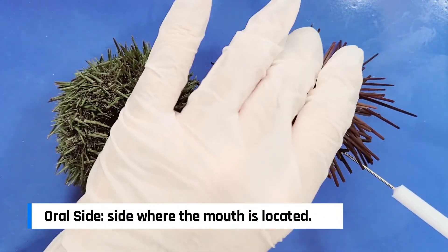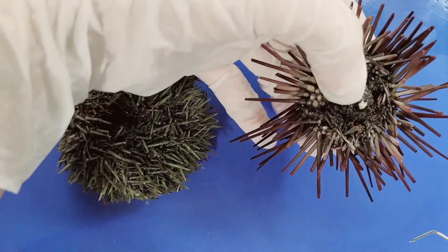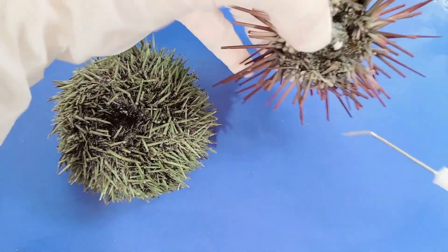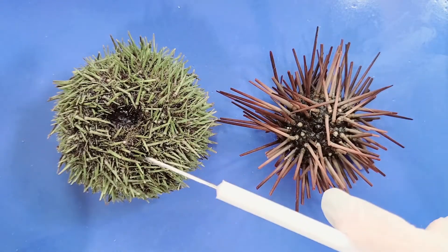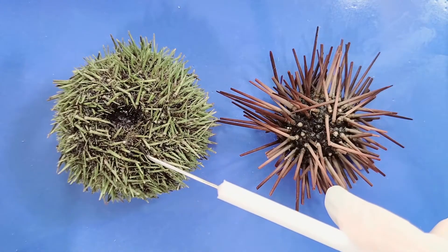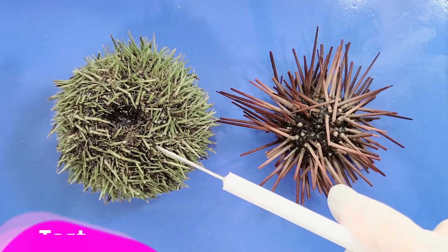You can also see this in the purple sea urchin — this would be the oral side. This hard covering is the skeleton of the sea urchin, and it's called the test.